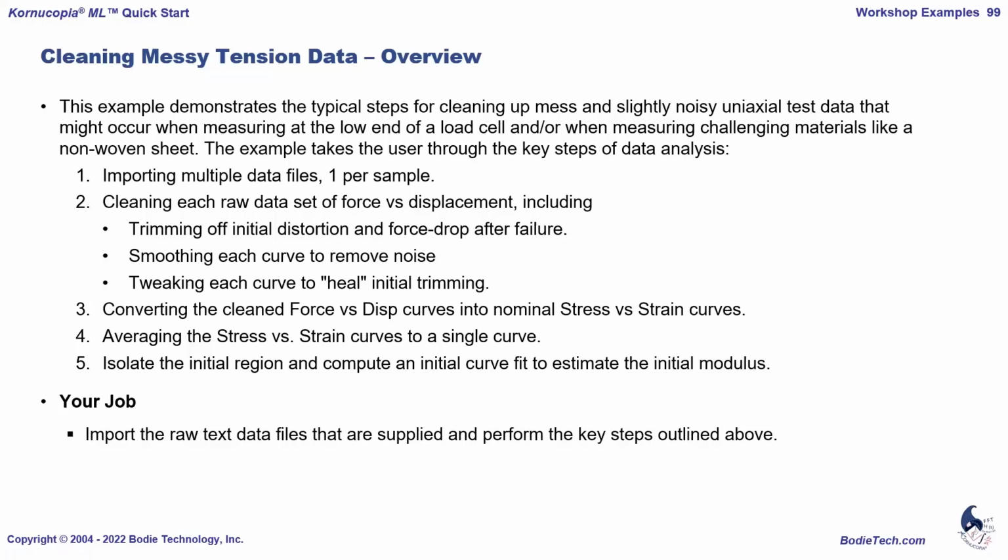So we'll be importing multiple data files, one file per sample, and we'll show you some efficient ways to do that. And then for each of those samples, we'll be cleaning up the force displacement data, which will mean trimming off an initial distortion that occurs at the beginning of the test that's due to some initial slack in the data. And then all the measurements are tested through and beyond failure, so we'll be trimming the data at the end of each curve where it drops off. And then we'll be taking each one of those curves after we've trimmed them and smoothing them so that we remove some of the noise that's in the data.